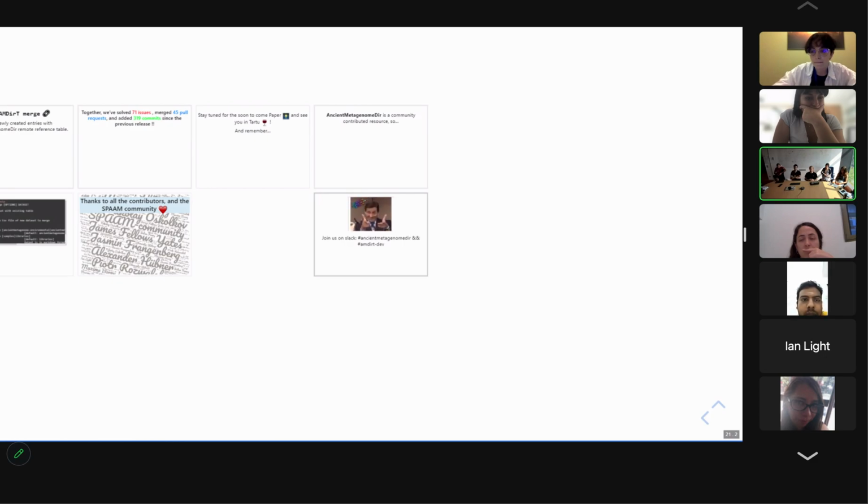So it doesn't matter if we query ENA or SRA. The information is the same everywhere. If people have uploaded the data to more exotic platforms, but there are not so many of them left, then unfortunately we can't really get the metadata.